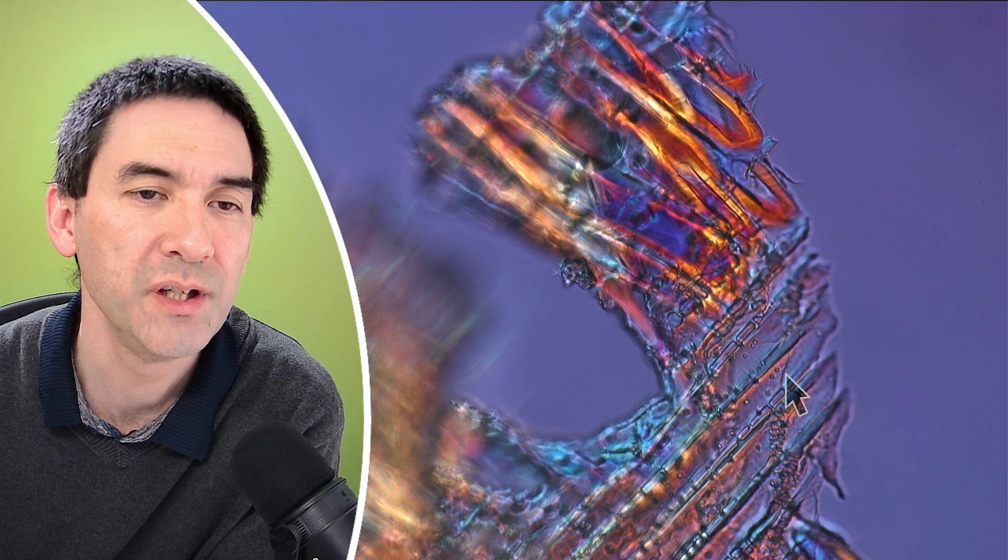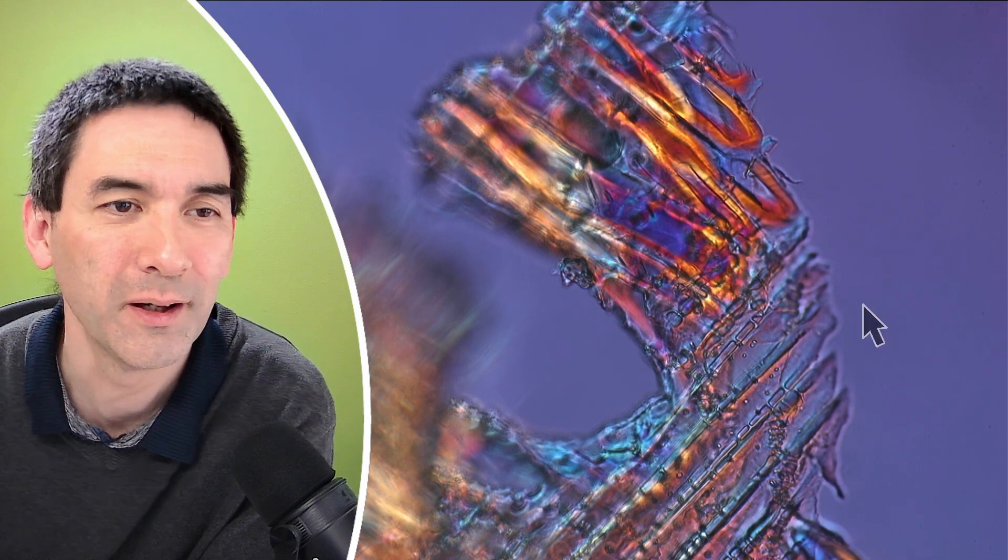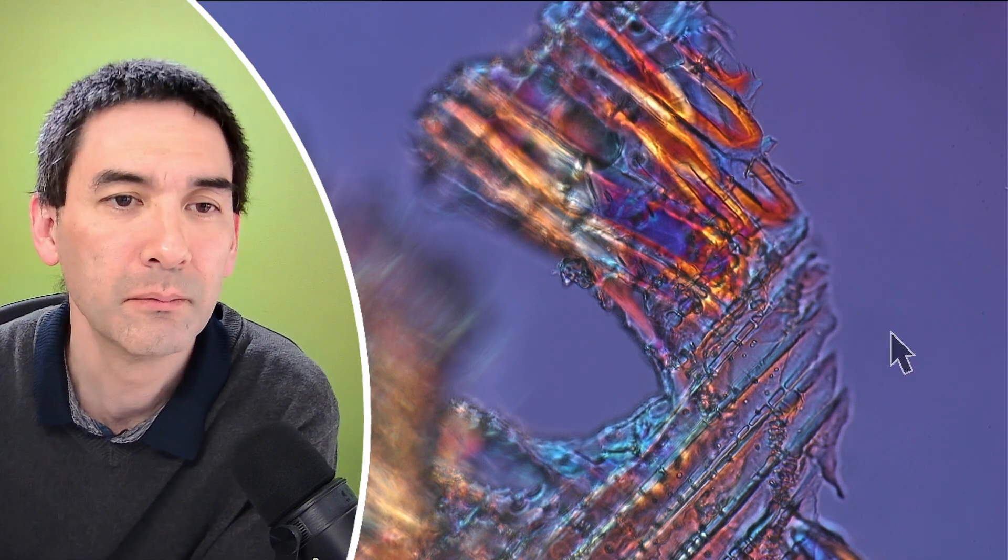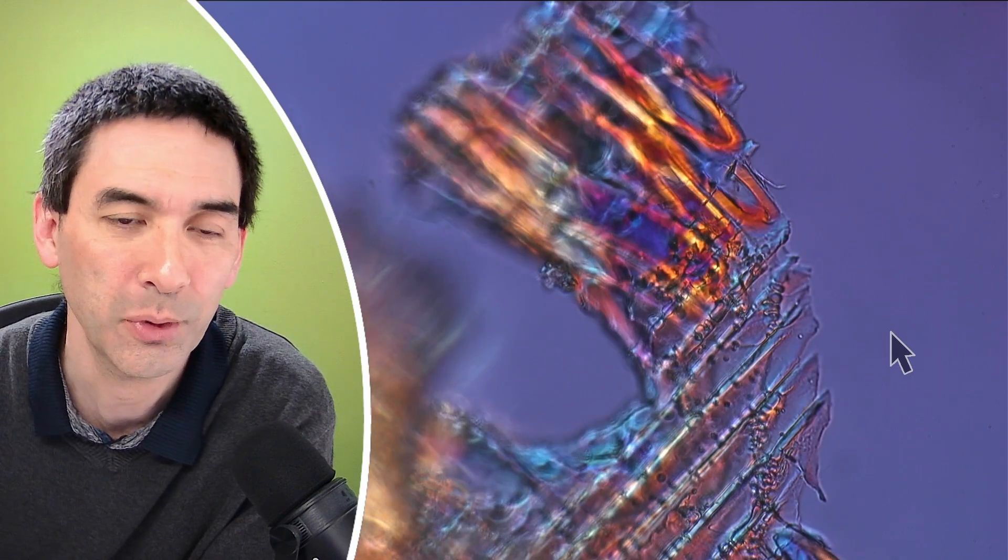The beautiful colors that you see here are because of the polarized light. What is this here? There's even something moving on here. I don't know, oh my gosh, I didn't expect that. This must have been probably in the water that I added, not in the wood because it was dry wood. So you see there are always a few surprises here.